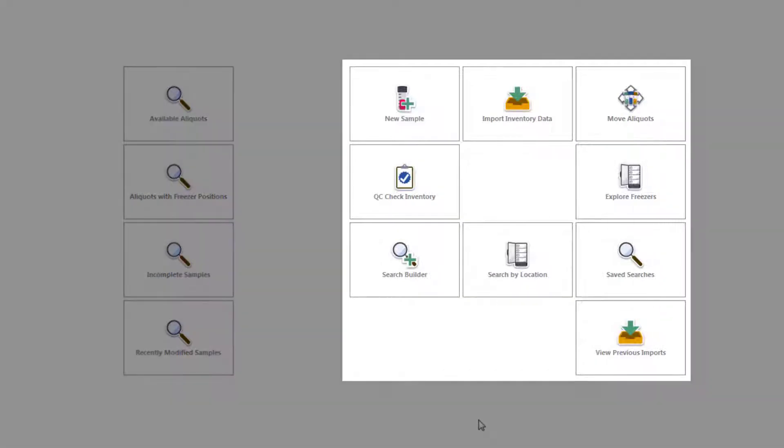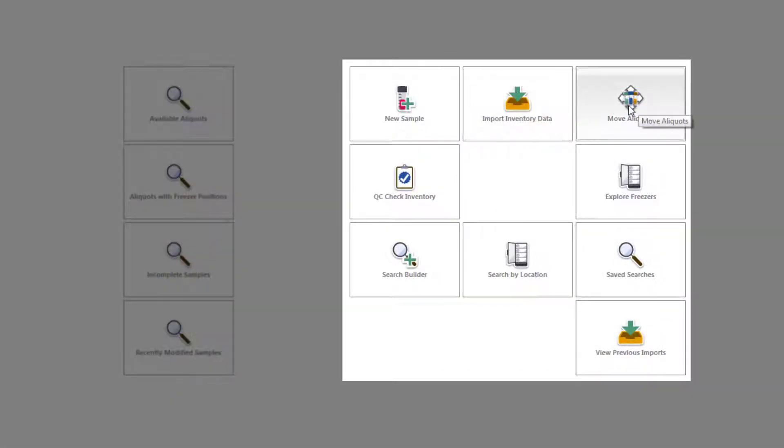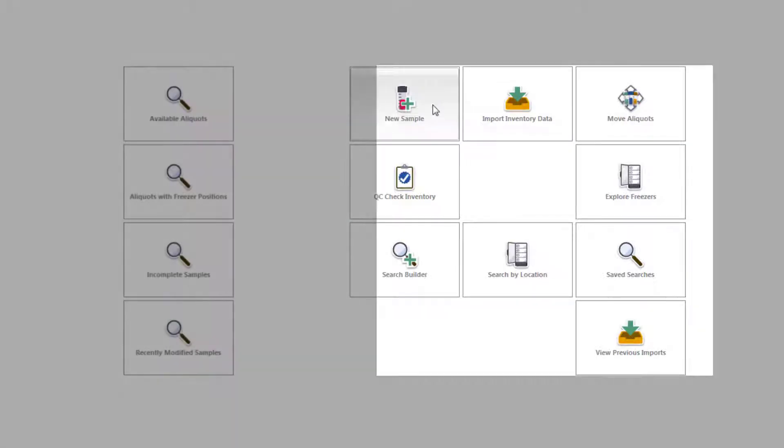On the right are some of the most important tools in the software, such as Import, Move Aliquots, and of course, New Sample.